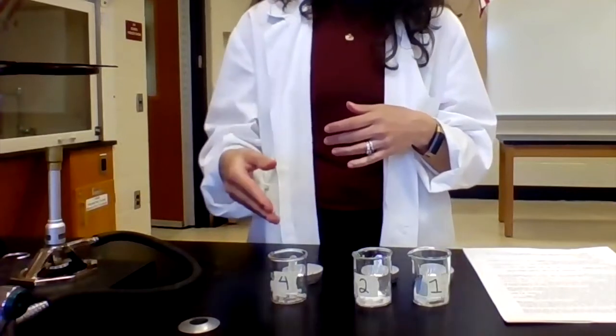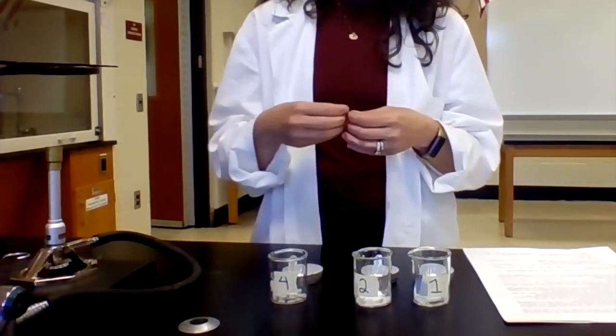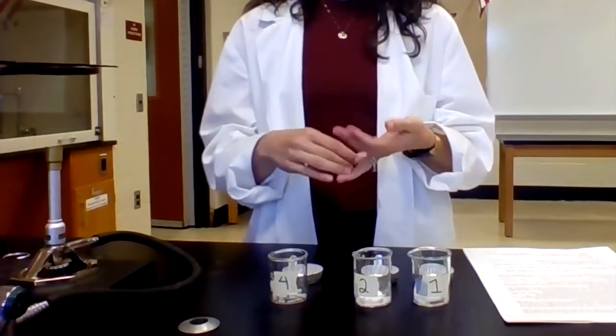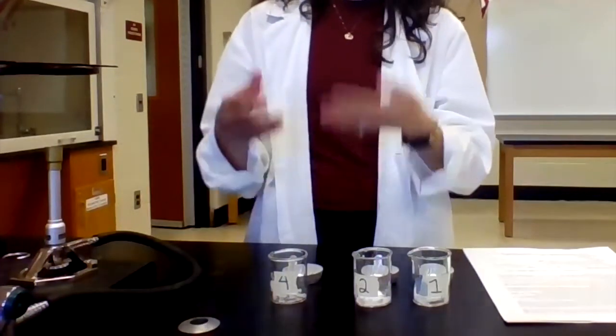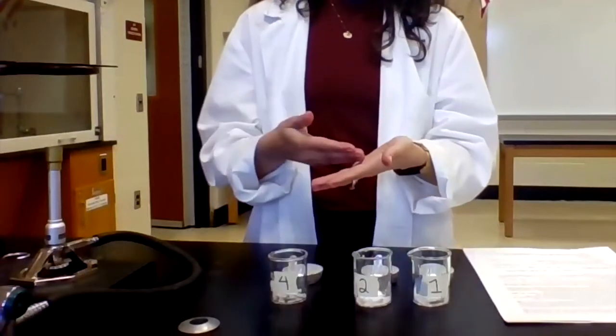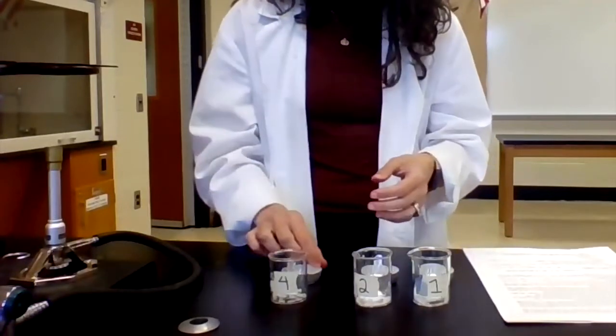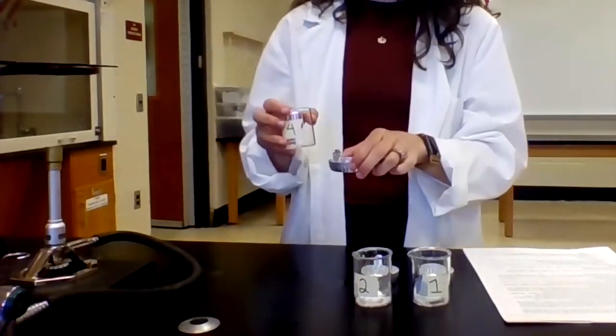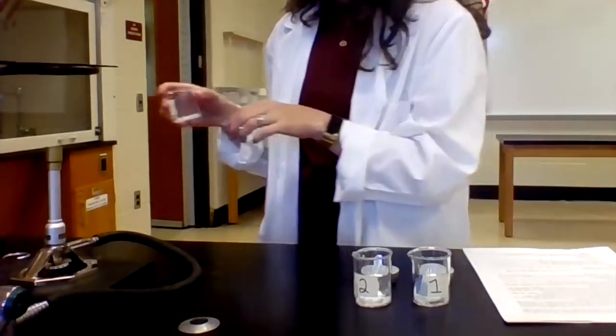Now I'm going to confirm that by testing its solubility in hexanes in a little bit, because hexanes, being a non-polar solvent, should dissolve a non-polar solid. Remember, like dissolves like. But for right now, we're going to put solid 4 off to the side. We'll come back to this when we do solubility.